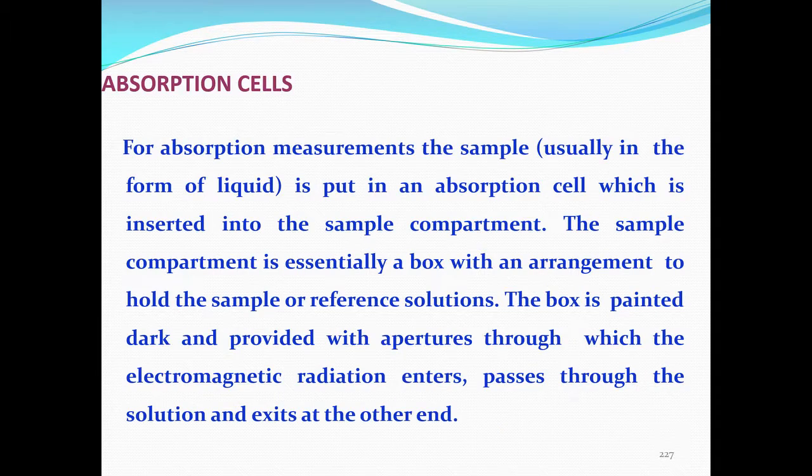I think I was discussing the optics of the instrumentation in the last class. That was about spectrophotometry. I think I had shown you this slide where I explained that the absorption measurement is always done in an absorption cell which is inserted into the sample compartment.